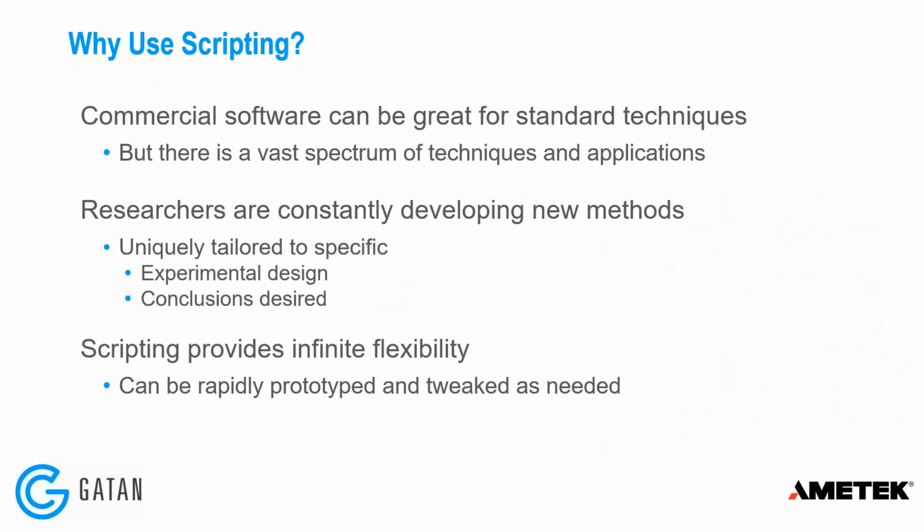So the next question I want to ask and then answer is, why use scripting? If Gatan already makes software that's designed for electron microscopy, why would you script? Commercial software like GMS can really be great for standard techniques that have been around for a while, but there's a vast spectrum of techniques and applications, and researchers are constantly developing new techniques, new methods.